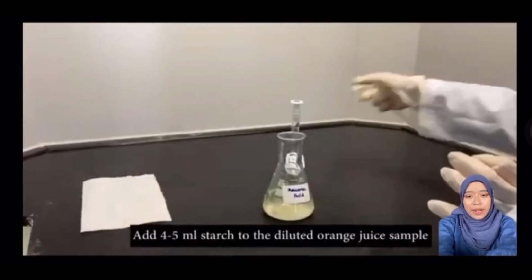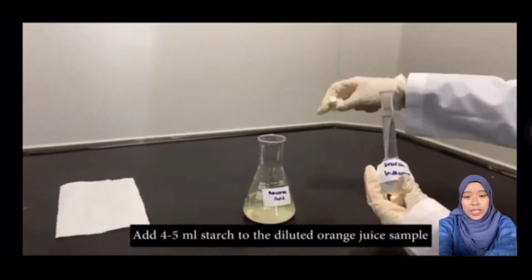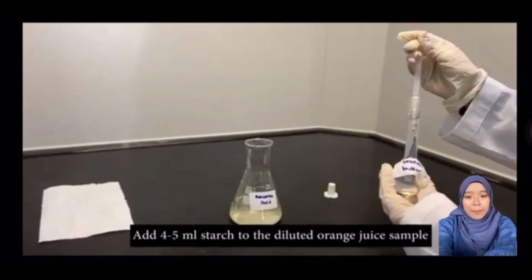Third, we need to add 4 to 5 ml of starch to the diluted orange juice, which is the sample.